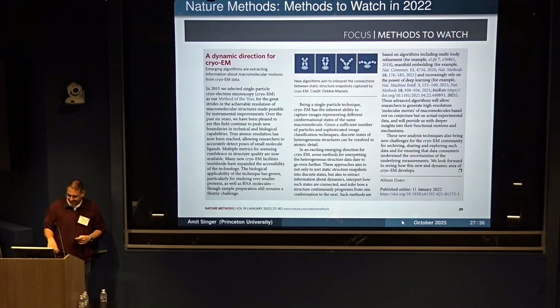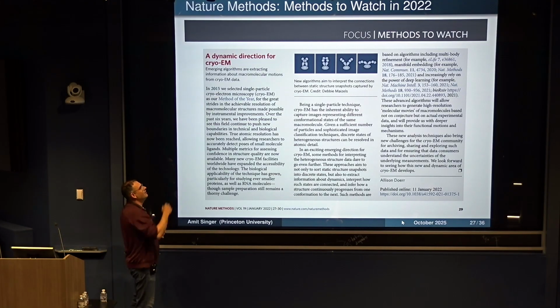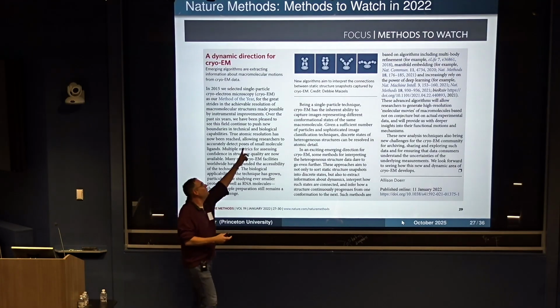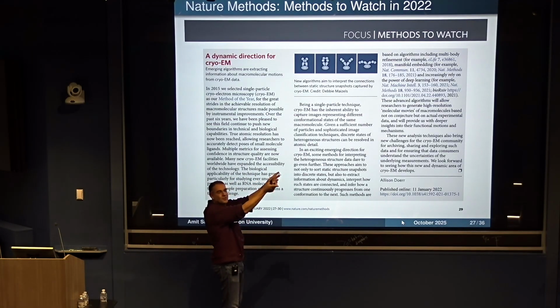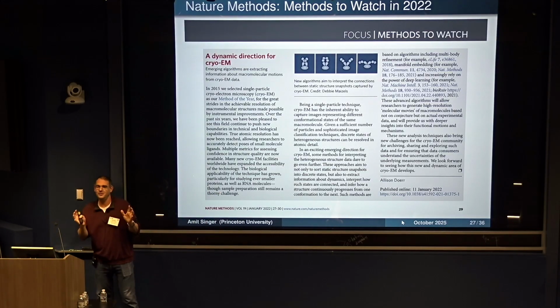Now I'm going to switch gears and talk about flexible molecules. This was the dynamic direction for cryo-EM, where you see here molecules that can be open or closed, molecules that can bend and twist, and there is no rigidity anymore.